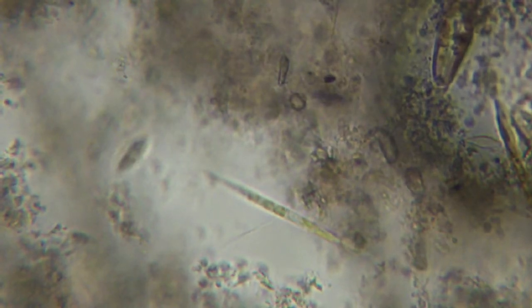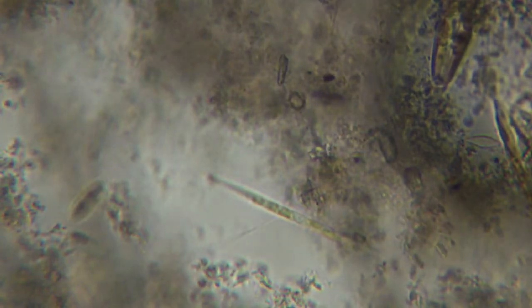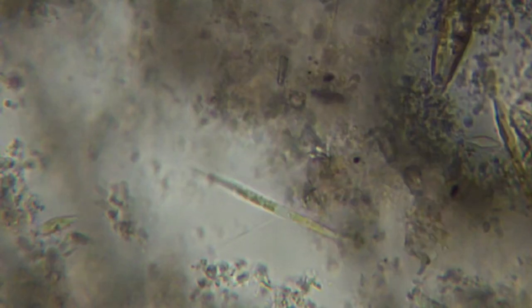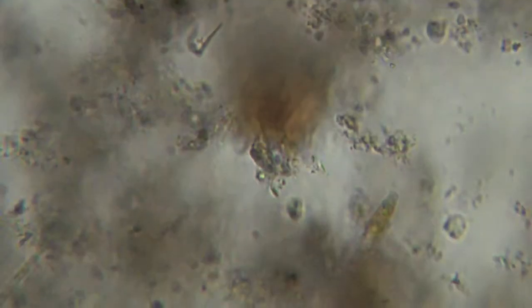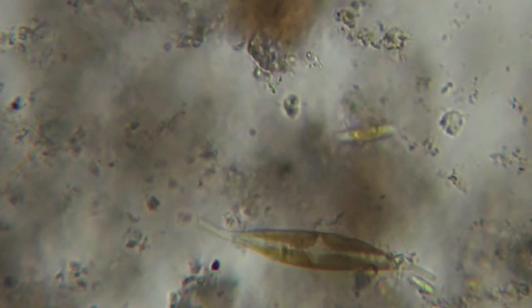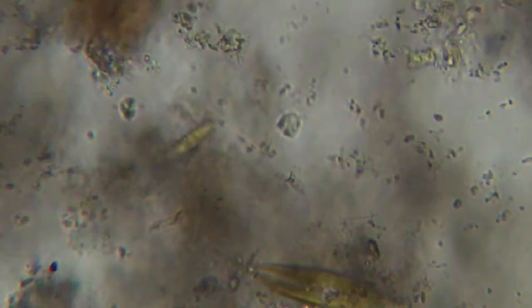Always fun to watch these guys. You imagine single cell plants swimming around doing their thing. Pretty crazy. A couple different types of diatoms. Long tapered ones, little cigar-like ones. Here's a big one. These are really nice ones in the area. Very beautiful. Just getting a lot of blockage from the debris, but you can see the colors very clearly.